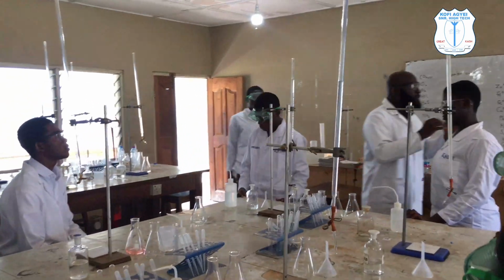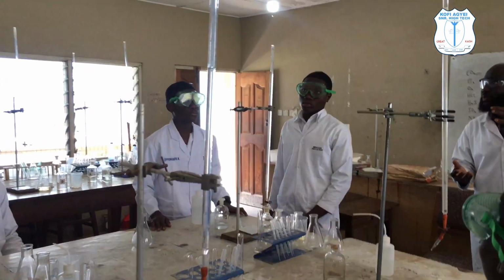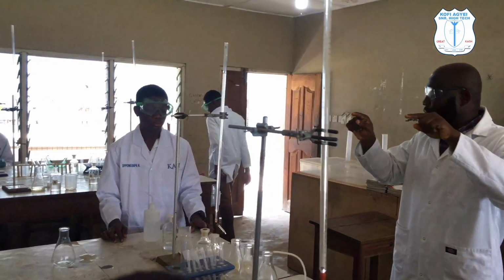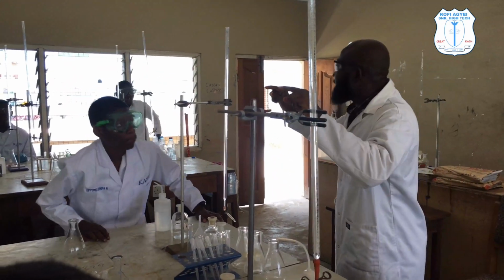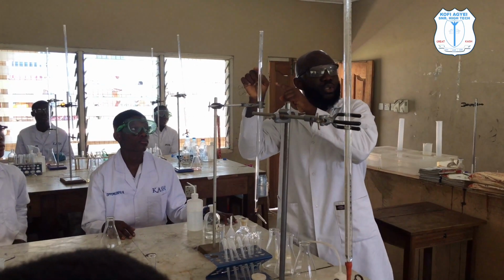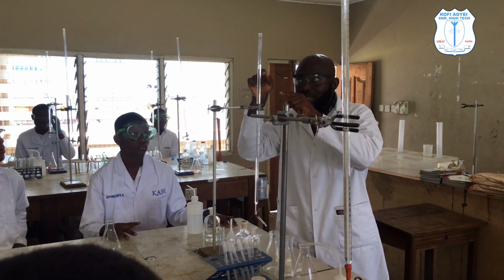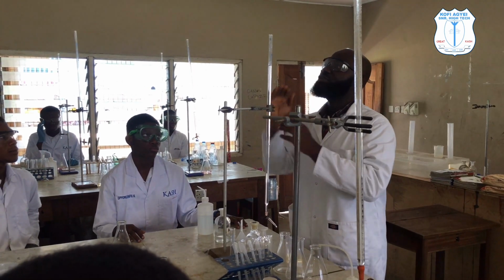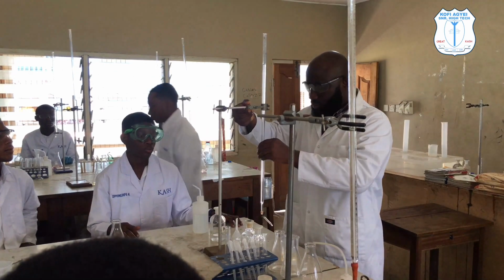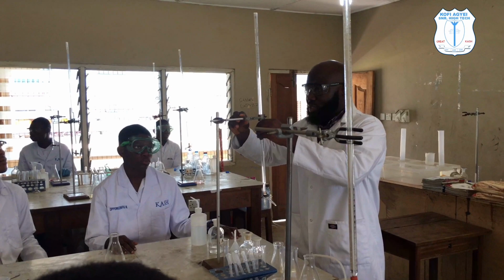Now anytime you see a solution in a cylindrical object, normally it gives us what? A curve. Are you with the concept? The solution gives us what? A curve. So for this one, you're going to take the reading from the bottom of what? The meniscus, where the curve is. That's where you take the reading from. You don't take the reading from the top. You take the reading from the bottom of the meniscus. So after adjusting to the 0 mark, you adjust it upwards.